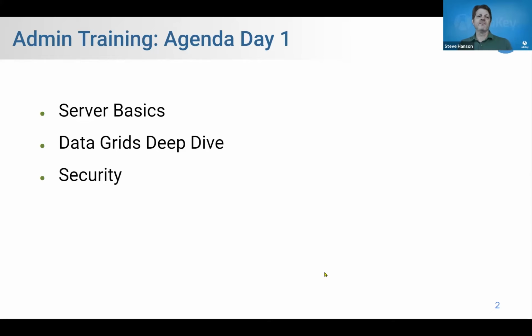And then for day 3, Friday, we're going to take a look at how LabKey server can work with clinical data and look at reporting inside the server. And again, we'll probably do a little deep dive in there. I'm just not sure what I'm going to do yet. Actually, the Q&A would be a good time to throw out some topics that you'd be interested in for day 2 and day 3. In any case, that's our agenda today.